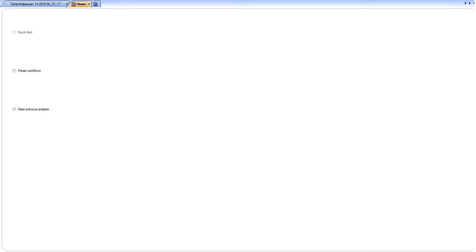This is a how-to video for Pinnacle Software. The focus of this video describes how to search for and verify single nucleotide polymorphisms or SNPs.